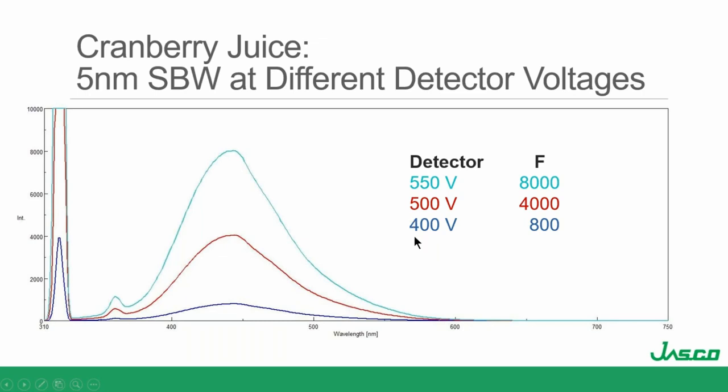And in fact, you know, given that the detector scale goes from 0 to 1,000 volts, we could easily do this at 2.5 if it was really important. That's another advantage of a continuous lamp, right? It gives so much output that we can keep closing those slits down and still have lots of intensity, lots of light throughput.